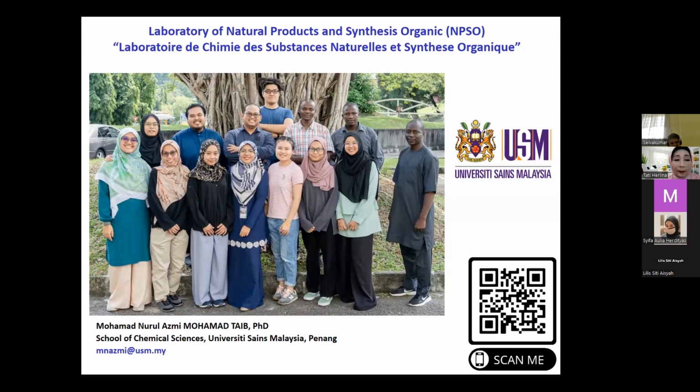Another trick is some websites, for example from Sigma Aldrich or Merck, already give you supporting information regarding the NMR. But the problem is we don't know what solvent they ran. You open Sigma, find the catalog name, click the compound, and you can see below it they have information on whether they have proton NMR or IR. This is common practice for the big suppliers, I mean Merck, Sigma, Acros, and so on.